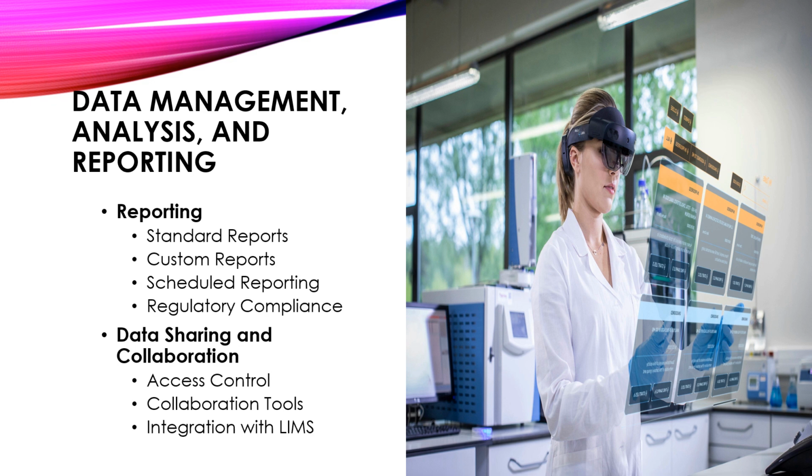Next is reporting. This can be in the form of standard reports, custom reports, scheduled reporting, regulatory compliance, and others. Now, standard reports. Laboratory management systems typically offer pre-configured templates for generating standard reports such as test results, quality control reports, and compliance reports.